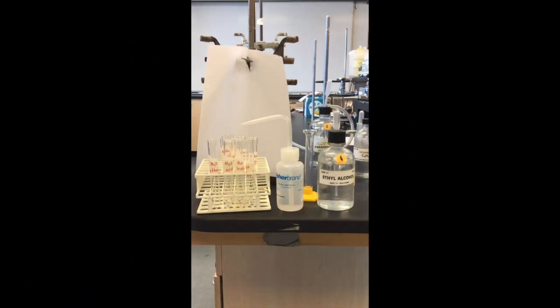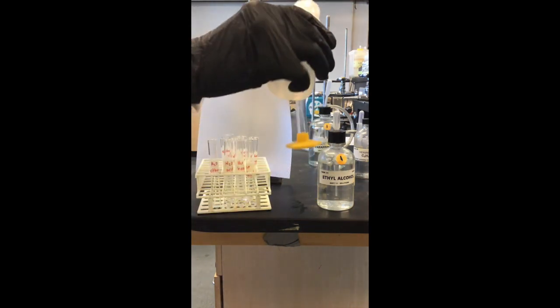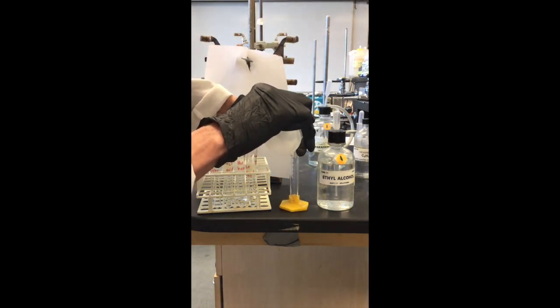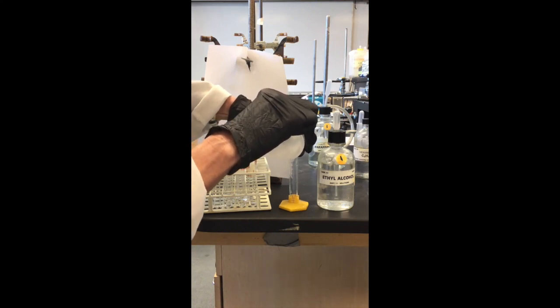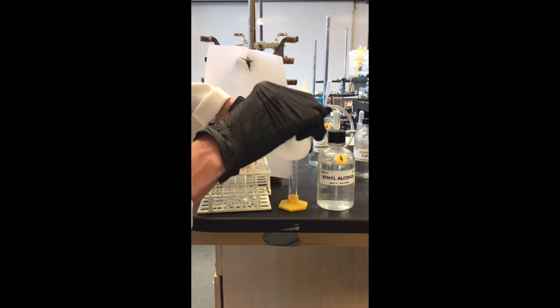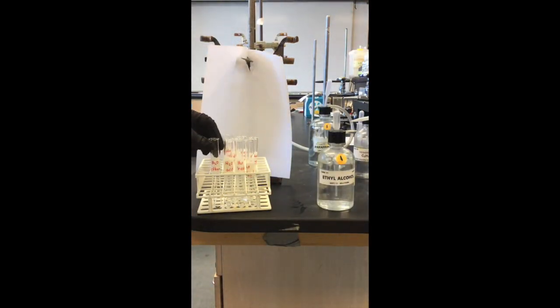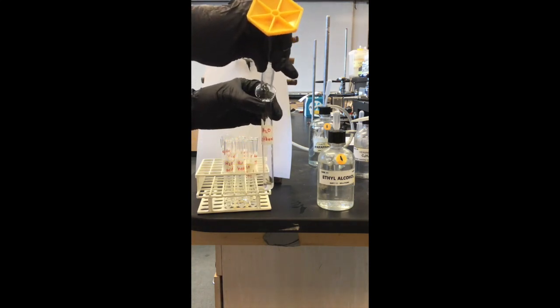The first two solutions that we're going to test if they're soluble in each other are ethanol and water. So we're going to do equal quantities of each. We're going to measure 1 ml of deionized water. I'm using my graduated cylinder for the first one, so I know about what 1 milliliter is when I put it into my test tube. Okay, so I'm doing it so the bottom of the meniscus touches the line at 1 milliliter. So I'm measuring 1 milliliter.